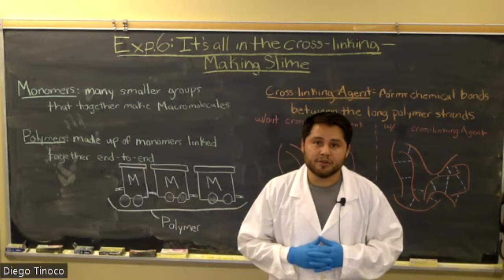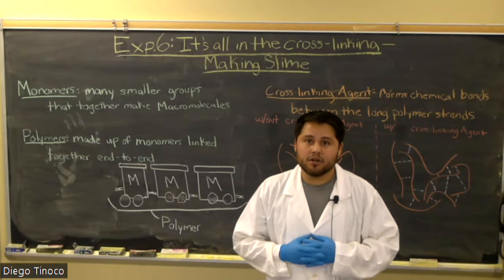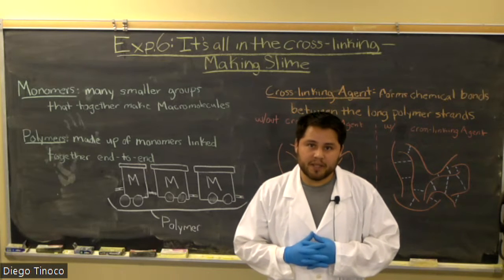Hi, my name is Diego Tinoco, and I'm a senior here at University of Redlands. Today's exciting lab is called It's All in the Cross-Linking: Making Slime.